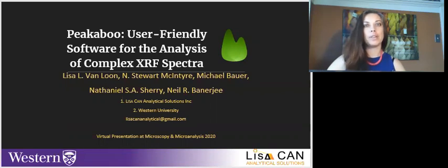My goal is to provide critical knowledge that allows for real-time decision-making using innovative technology, adding value in mineral exploration, processing, and remediation. Since 2017, I've been working with Neil Banerjee, Stuart McIntyre, Mike Bauer, and Nathaniel Sherry to innovate XRF fitting, particularly for synchrotron-based data. The result is Peakaboo. Today, I'm delighted to show you some of the most important innovations, how easy and intuitive it is for new users, and I'll share examples from earth and environmental sciences and archaeometry throughout.